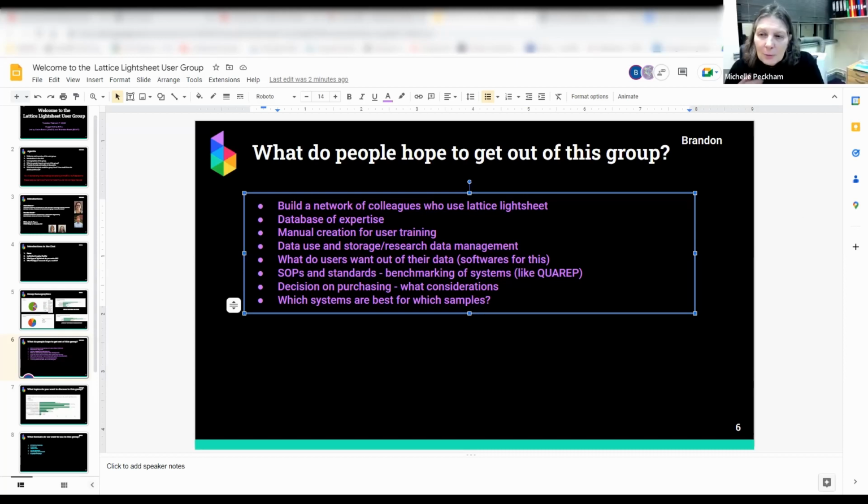I think that's good. We've had lots of different things; obviously the clearing thing was targeted at the person who was trying to decide which kind of light sheet to buy. If you're talking about just Lattice Lightsheets, which is absolutely fine for this group to be all about, because as you said, there's still lots of different things that people put on their Lattice sheet, and things that perhaps work well, because we've already had expansion microscopy samples, live cell imaging, organoid imaging, spheroid imaging, and as I said, these lipid chemistry experiments going on the Lattice Lightsheet.